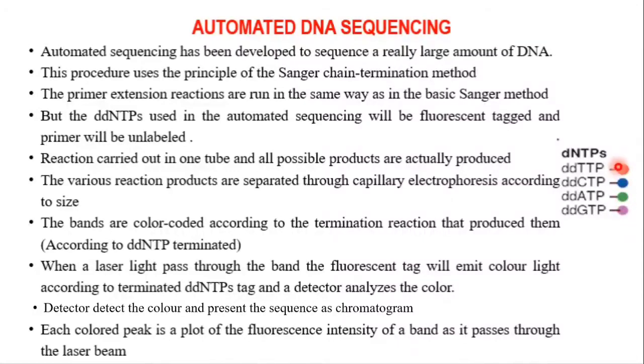So different color markers are used for the fluorescent tags on the ddNTPs. You see, dNTPs are there, and ddNTPs are also there, and there is a difference.